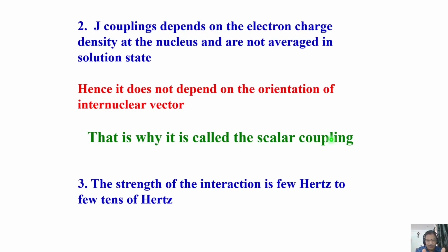So it can be a few hertz, 10 hertz, 5 hertz, 0 hertz, close to 0, maybe 0.1 hertz to a large value. In a heteronuclear case, it can be very large also. So it depends upon the coupling strength, whether it is homonuclear or heteronuclear. If the coupling is between like spins, like homonuclear spins, there are ways we can say what the coupling strength is for 1 bond, 2 bond, 3 bond, like that.